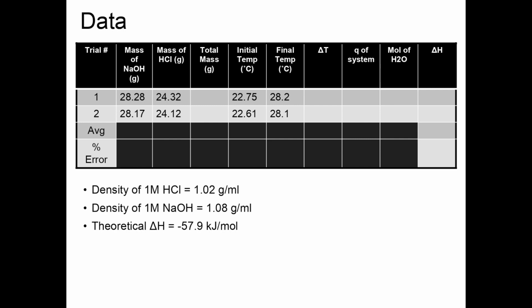Alrighty, so welcome back if you did go and watch that video. If not, I highly recommend it so you have a better visual and you may answer some questions that you might have. So I'm just going to give you a quick overview of the data table. We took data from some students from last year for this experiment, so this is real data, not fake. We have the mass of our NaOH and the mass of our HCl that were weighed separately. And then when you add them together, you get the final mass of your product, which, if you look through a balanced equation that you make up for your lab, you can see is supposed to be your water.